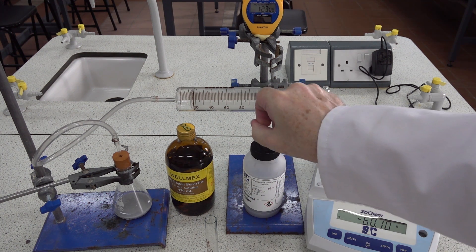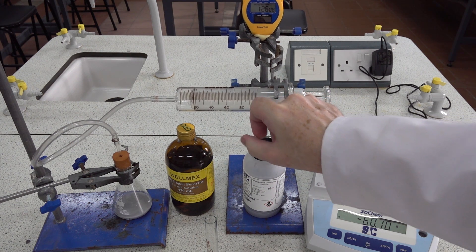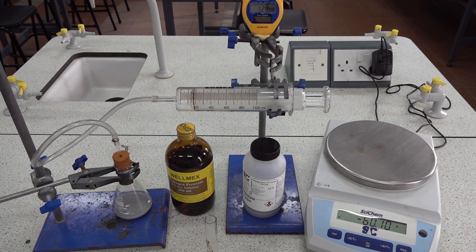Occasionally you have to give the barrel of the gas syringe a tap to make sure the plunger is moving freely.